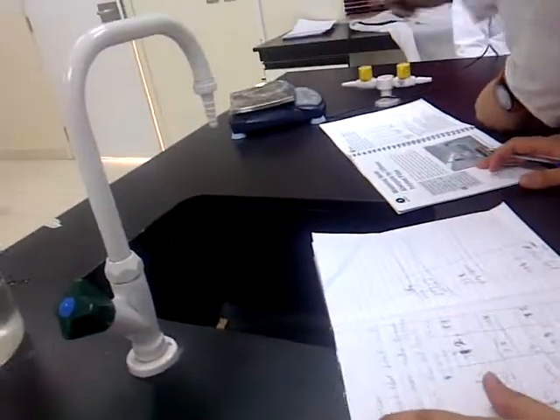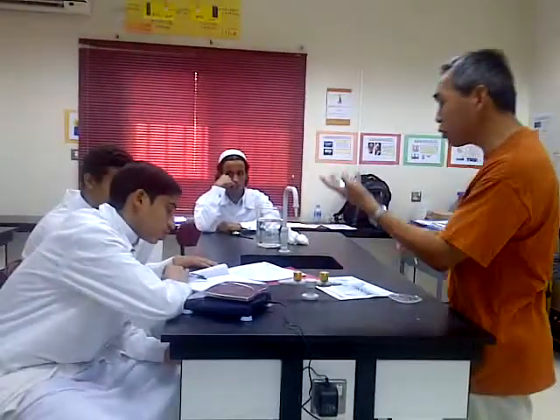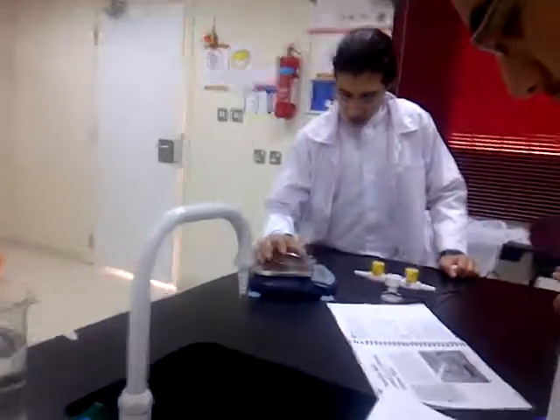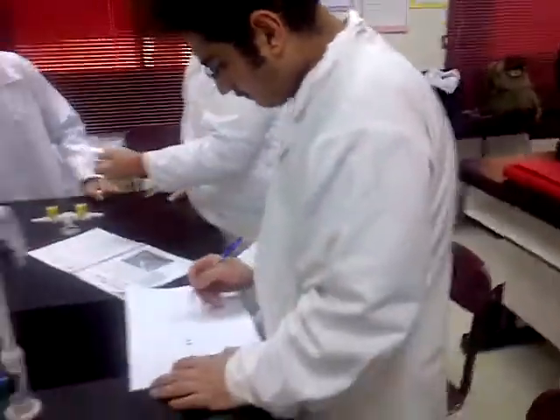Weight percent of the polyvinyl acetate. I'm expecting a certain percentage. I just wanted to see experimentally whether you get that. Do you understand what I'm trying to say? You know the weight of this glass, right? You know the weight of this, right? Subtract it from your original. Originally it's all dry. You have the polyvinyl acetate in the glass, right? You get that, the very, very first number you get. First number is polymer in the glass, right?